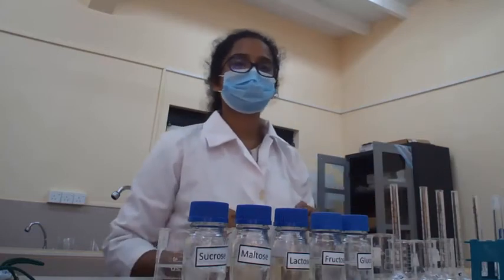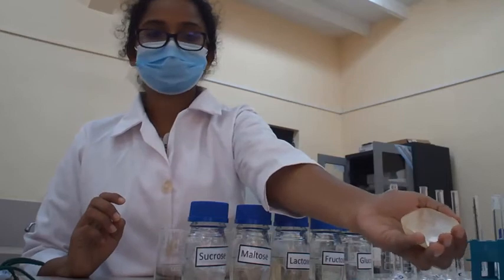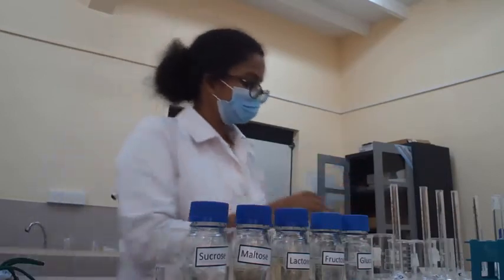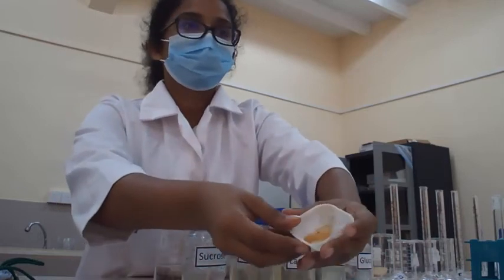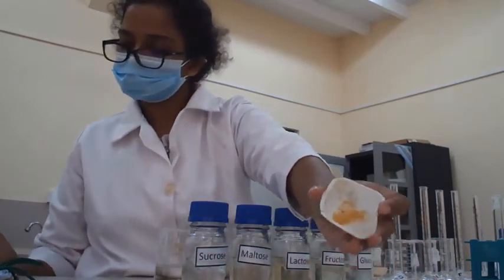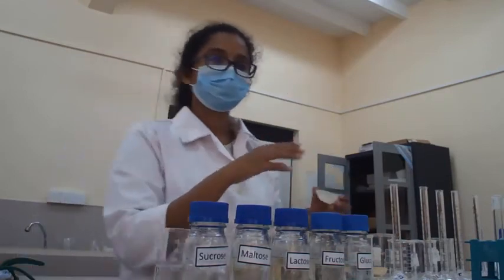Then after that, we are going to add 0.3 gram of sodium acetate and 0.1 gram of phenylhydrazine into each of these test tubes.